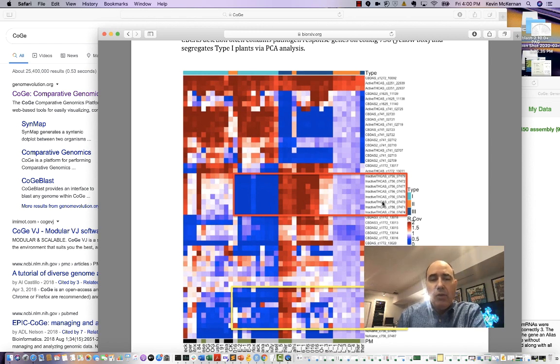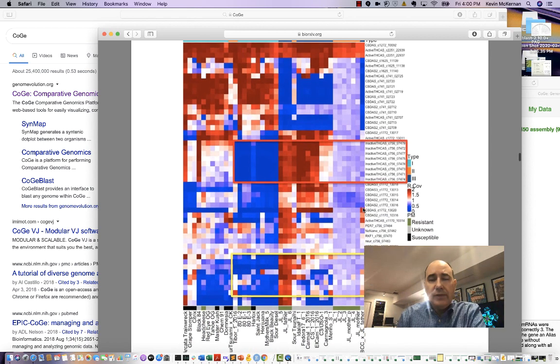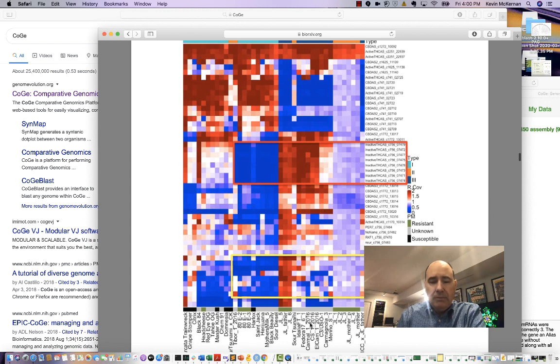Okay, so you'll see that many of the lines have copies of this. Particularly, some of these ones are in fact hemp lines. So when you breed for hemp lines, you've got to make sure that if you have a hemp line that still has 8 of these inactive THC synthase genes, they may cause a problem. They may leak on you and still be slightly active, right? So a lot of growers right now want to breed hemp lines that have this 2 megabase deletion. There is a common deletion in the population where this whole cassette is knocked out.